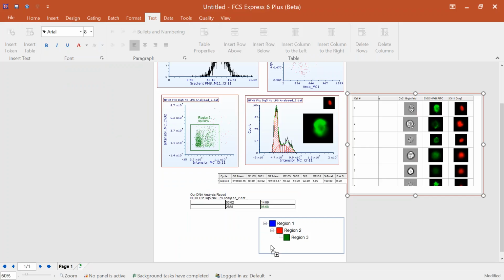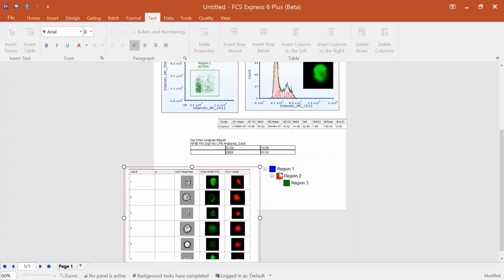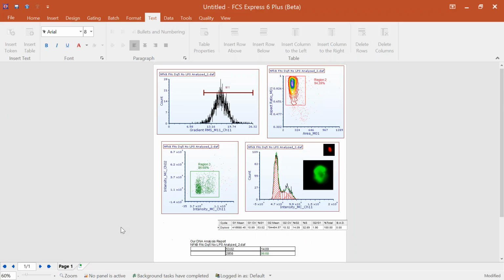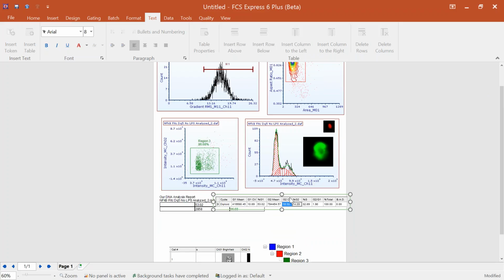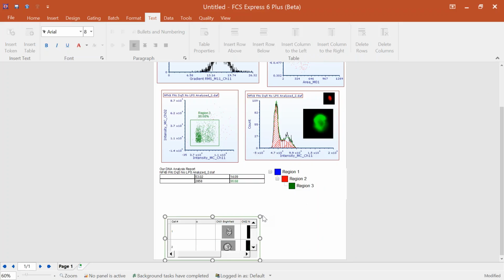We have our data grid that we want to put down here. We just have to find a place to put everything, just like you might fight with a PowerPoint presentation sometimes to find enough room for everything. We'll find a little bit of space down here, maybe even move our table up here, get rid of this guy. We'll find room for everything.